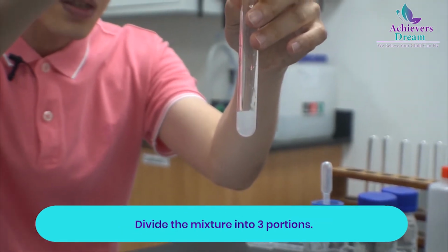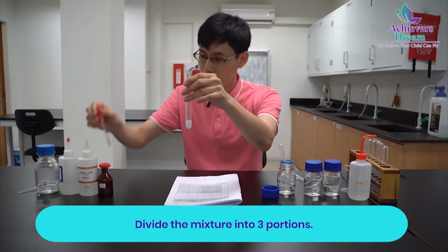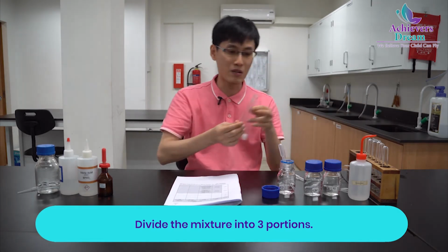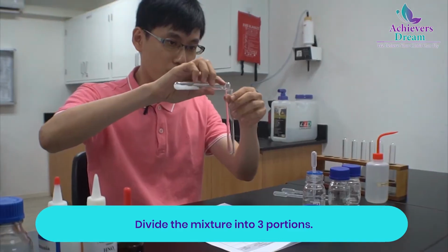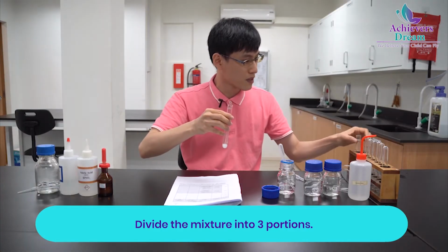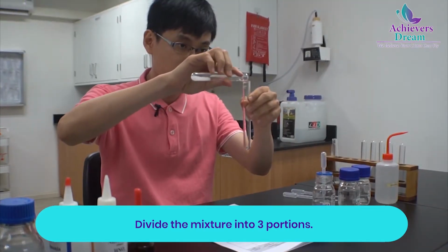There's a formation of a white precipitate. Okay, so let's divide this solution into 3 portions now. I'll transfer a bit to an empty test tube and a little bit more to another empty test tube.